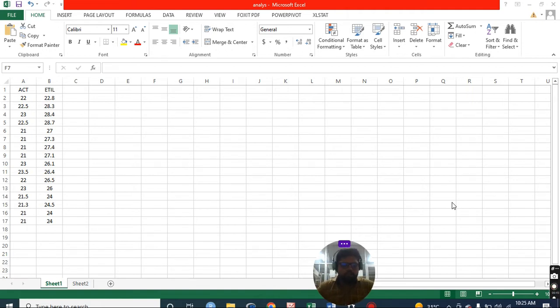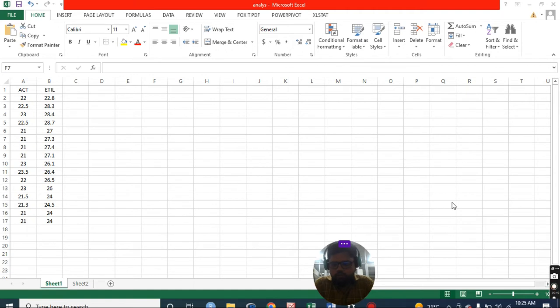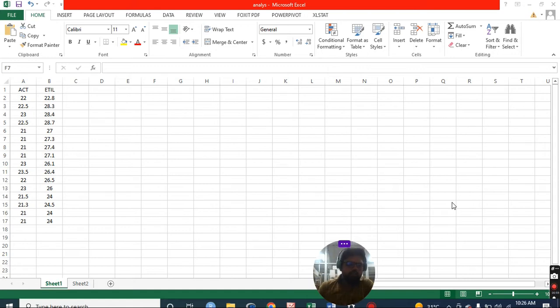I was searching for some packages where we can do this analysis. Fortunately, I got one package called PCR. It is a package shown in the last video. You can install it.